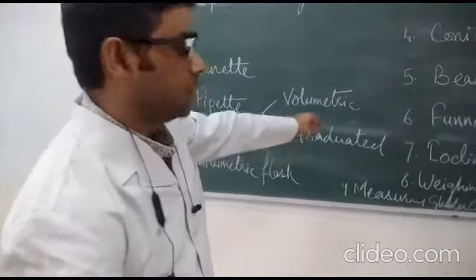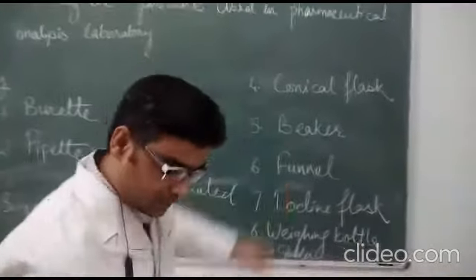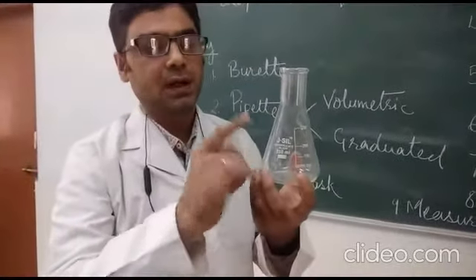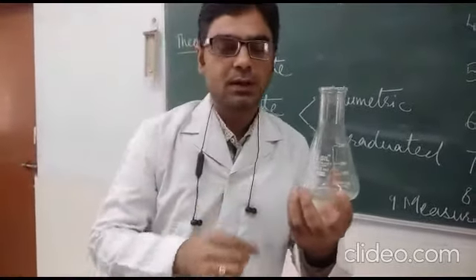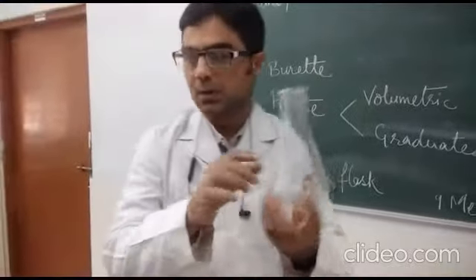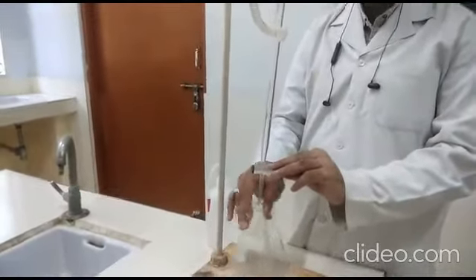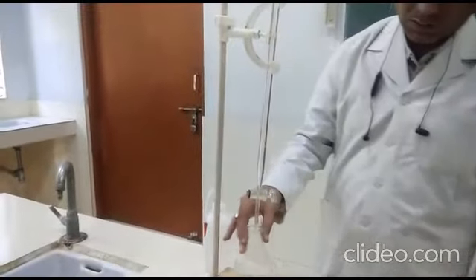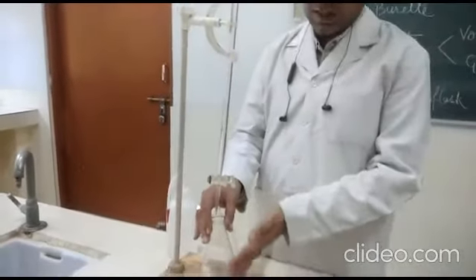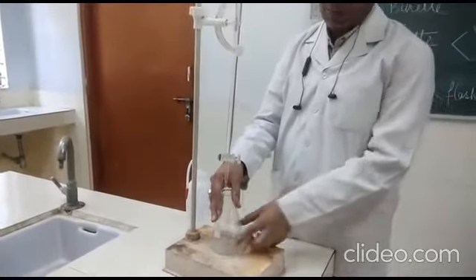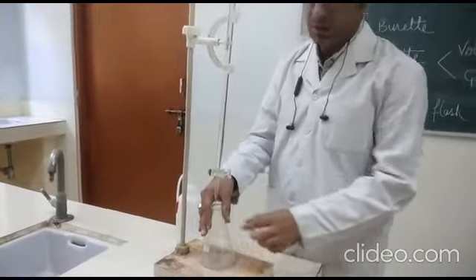Then we have the conical flask. This is a 250 ml conical flask. We have conical flasks of varied volumes. It is used to place the sample, and it is placed below the burette so that we can add the standard solution from the burette while swirling. Its shape is designed so that swirling does not allow the solution to spill out — that is why it has a beak-like shape.